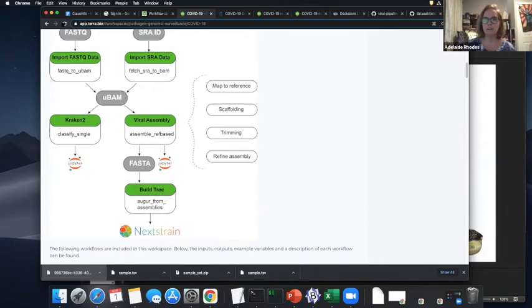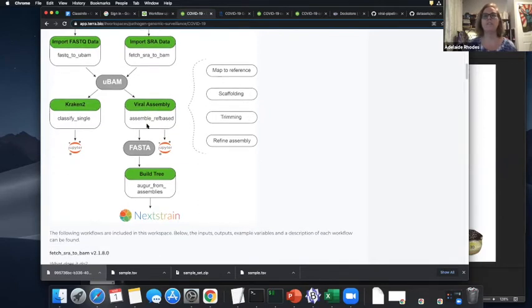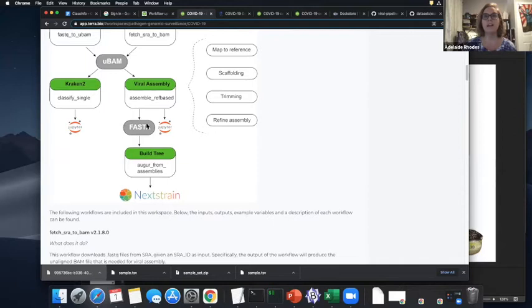So this is a WDL, this is a WDL. Each of the little green headers is the name of a WDL, and they named their WDLs the same as their diagram. Believe it or not, not everybody is that considerate, you know what I mean? Be consistent in your naming, I guess, is what I liked about this workspace also.